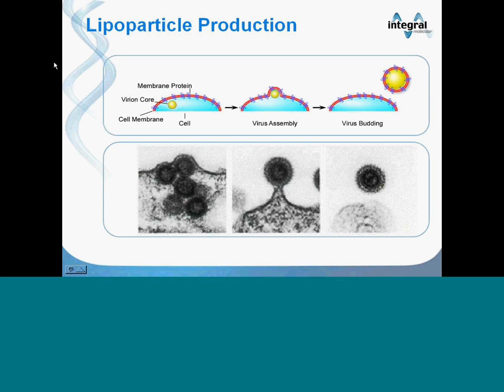You want the volume of lipoparticles that are needed? Not volume, but the amount of lipoparticle that you need to inject. Are you having to inject quite a lot of lipoparticle, or in a typical preparation do you not use much?